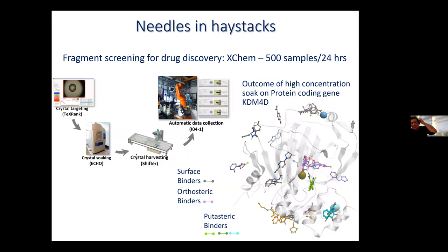And then finally, the third thing that we do nowadays in modern protein crystallography is we use it as part of the discovery process for new drugs. So pretty much every new drug that's designed and produced, at some point uses information gathered at a synchrotron. And typically you might have some large complicated biological target molecule. You want to know in the first instance, how do you stick a chemical agent, the drug, if you like, onto the particular part of the biological molecule that you want to change?